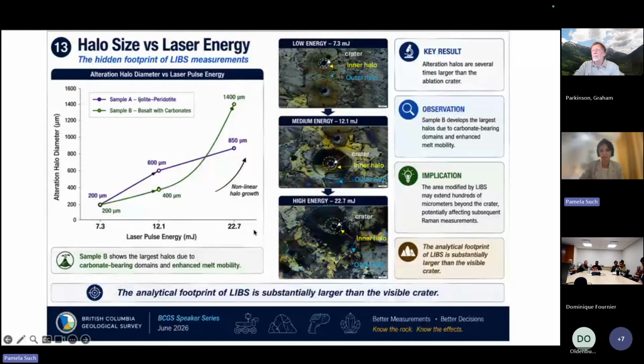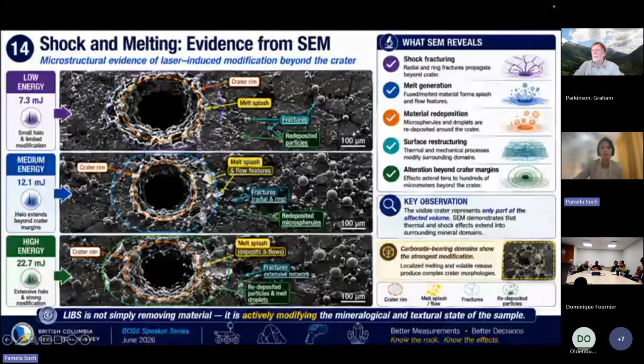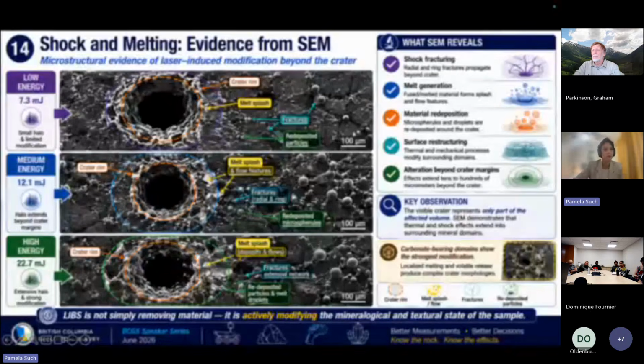So that was visual, and it was observed as well in the SEM-EDS. These are real SEM-EDS images, but they are improved with AI as well, I'm sorry about that. What I wanted to show here is that for the lower energy, around and outside the area of impact, there were fractures in the rocks, observable in the SEM-EDS during the studies.